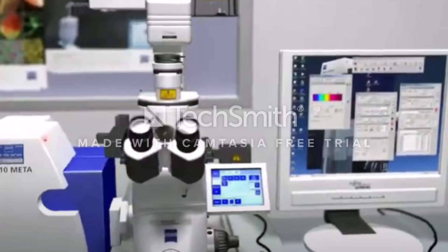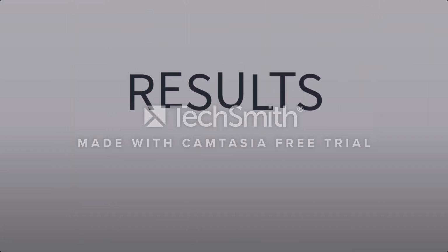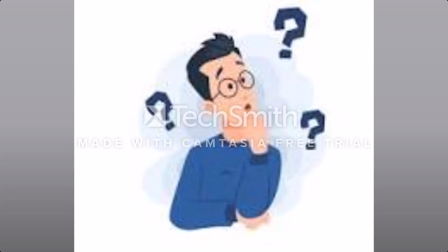With this configuration of the voxel size of the lens, we can create high-quality and clearer images when compared to other microscopes available in the market. Once clearer images are available as ground truths, the accuracy of the segmentation algorithms would be higher than blurred images. The makers of this challenge have also provided results obtained by various participants. Here, we will highlight the performance of the algorithms and show only the best obtained results when tested against the examples of datasets shown before.